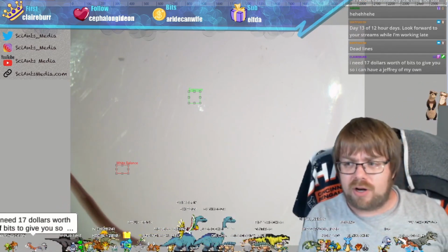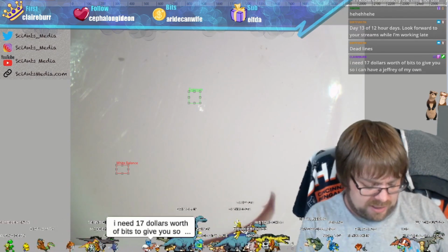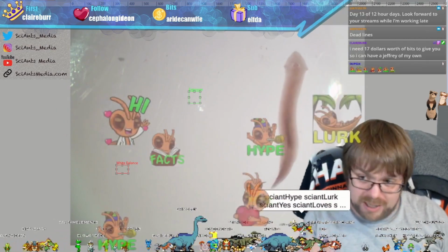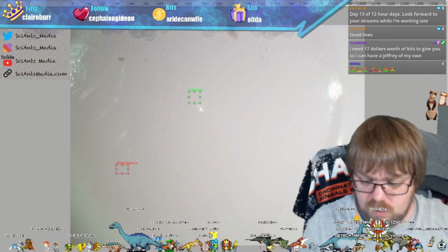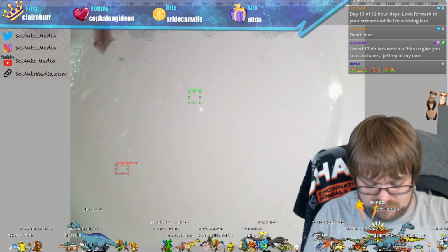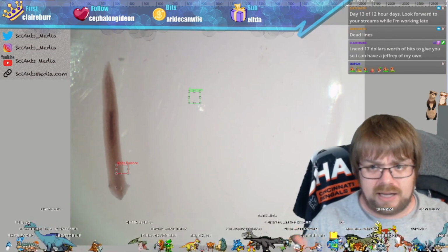But the actual protocol is a razor blade. You use a razor blade to cut it in half, and then we leave it in Planarian water, which is the water that we're using, like the special pH balanced solution, and he will regenerate.